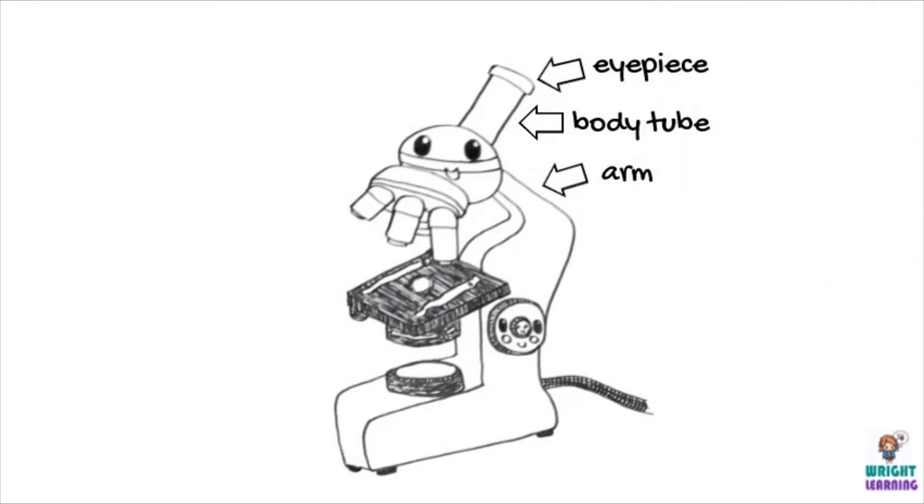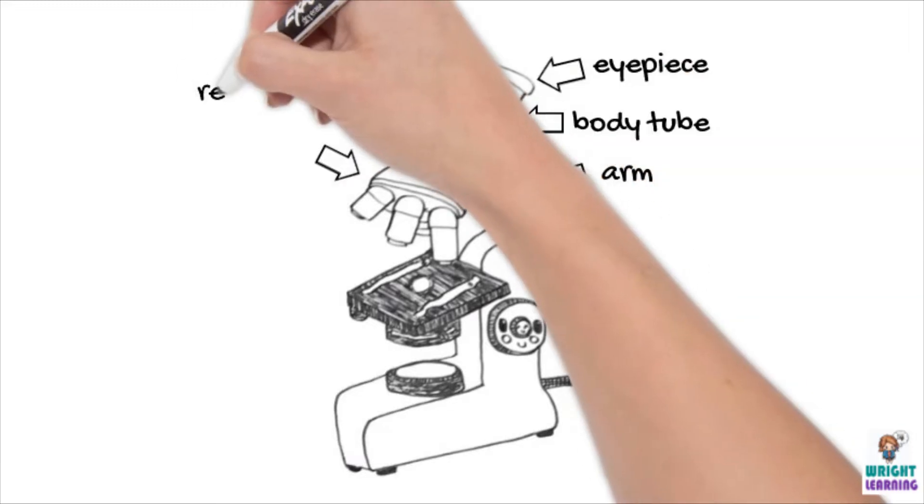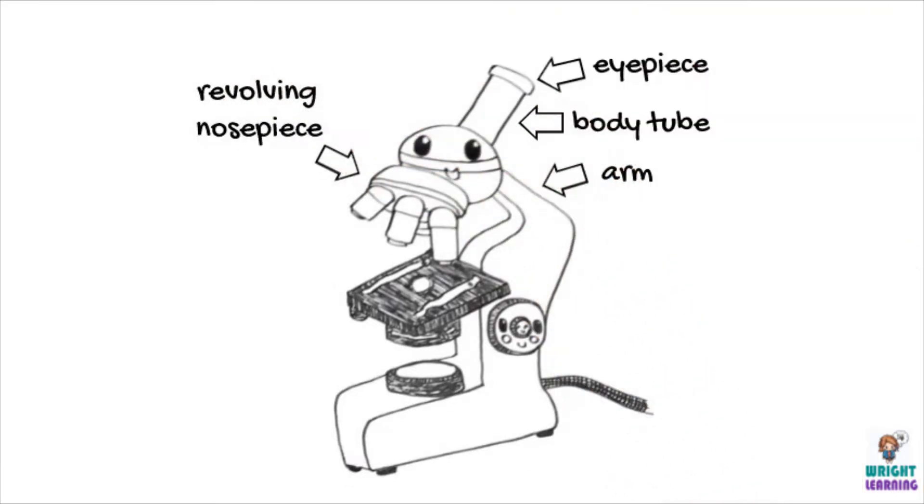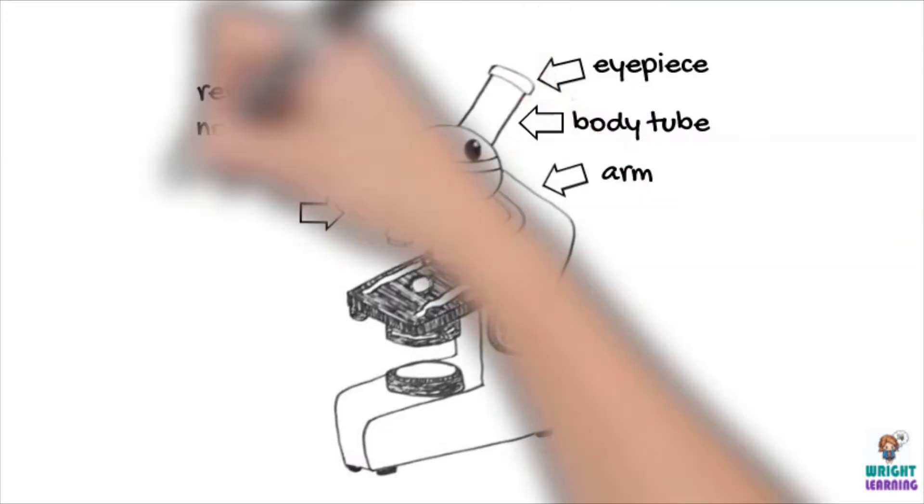This part of the microscope is called the arm, and is important when you're carrying your microscope. The revolving nosepiece allows you to adjust which of the objective lenses you're using to view your sample.